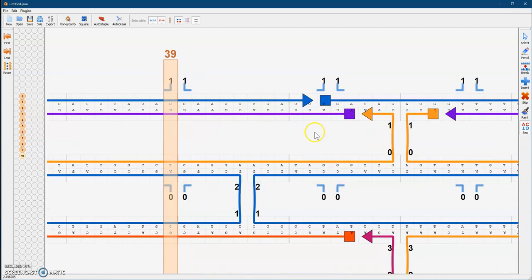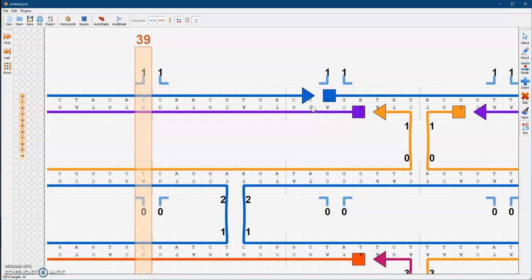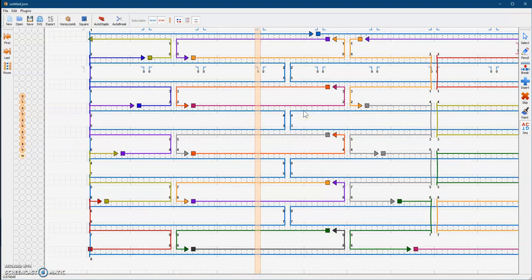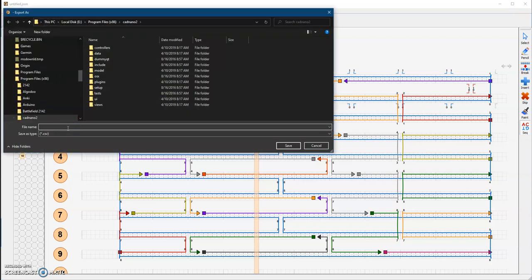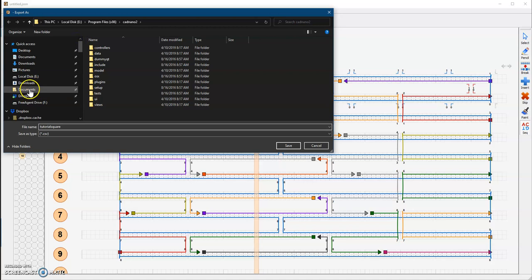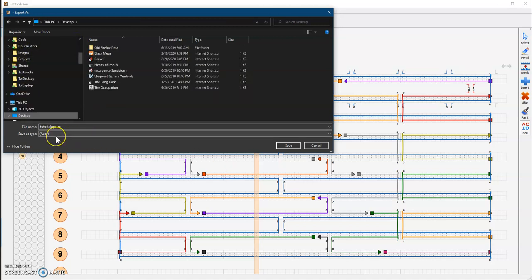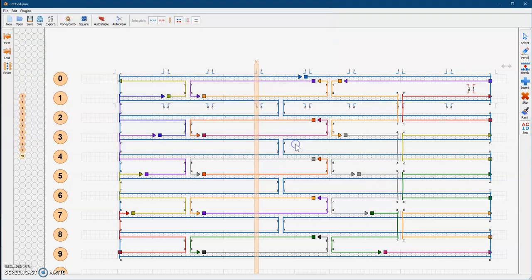If you zoom in, you can see your DNA sequences. And that's pretty much it. Now you're ready to export this file and save it. You click export, give it a name — I named mine 'tutorial square' — and save it to your desktop. After that it gets saved. On the next part, we're going to talk about looking at your DNA as an Excel file, and then uploading it to a program called CanDo where you can see a simulation of your structure. So this concludes this part of the lecture.